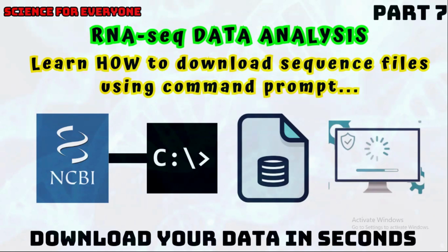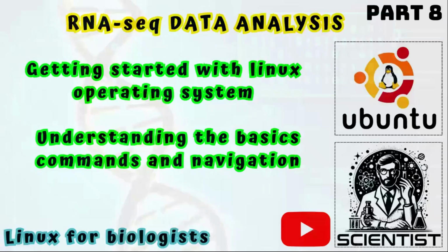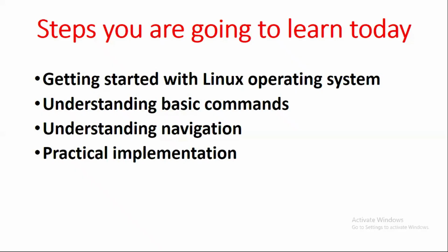Okay, so now if you have your data and you want to analyze it using Linux operating system, first of all, you should know about the basics of Linux operating system. Then you can proceed with your data, and in part 9 and the upcoming videos, you can easily understand what basically this command is for and how we will use it. Okay, so let's start with the practical.